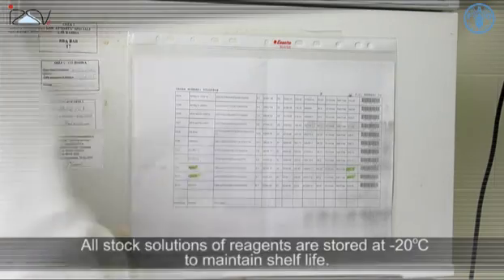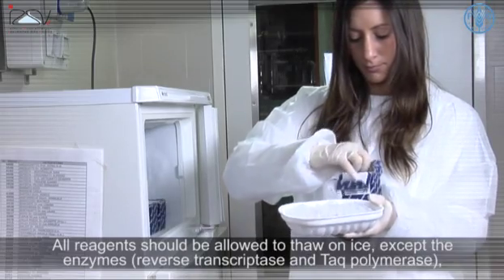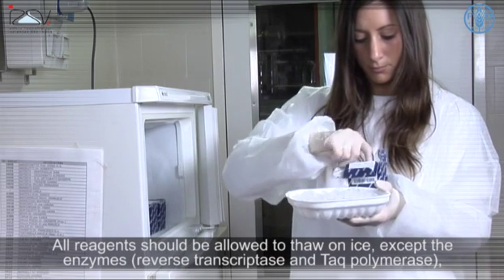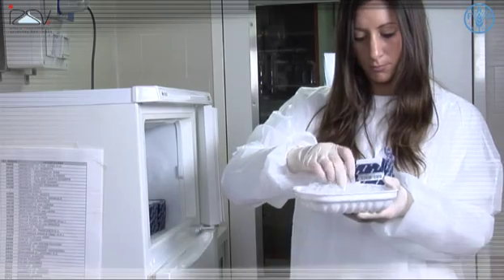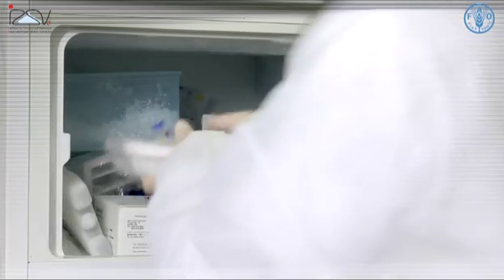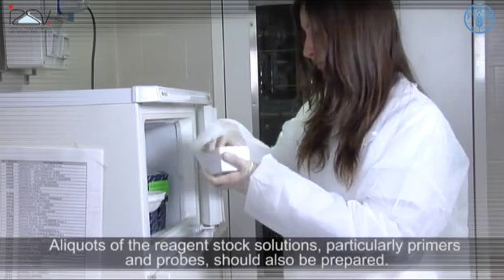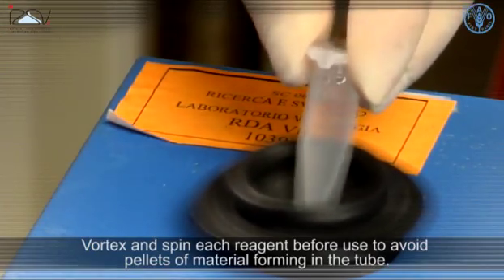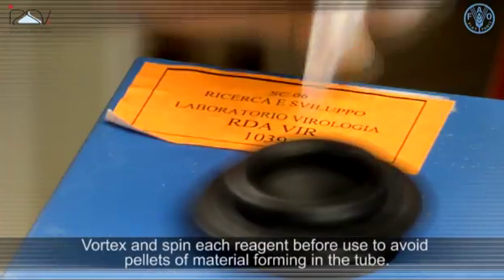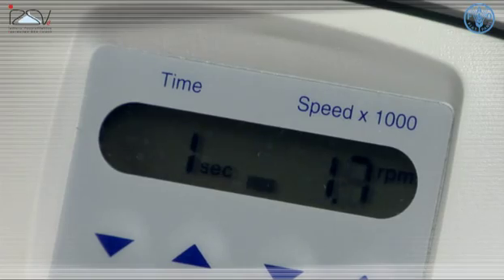A devoted refrigerator should be present inside the mix room for the storage of molecular reagents. All stock solutions of reagents are stored at minus 20 degrees Celsius to maintain shelf life. All reagents should be allowed to thaw on ice, except the enzymes reverse transcriptase and Taq polymerase, which should be kept at minus 20 degrees Celsius until used to avoid degradation. Aliquots of the reagent stock solutions, particularly the primers and probes, should also be prepared. Vortex and spin each reagent before use to avoid pellets of material forming in the tube.